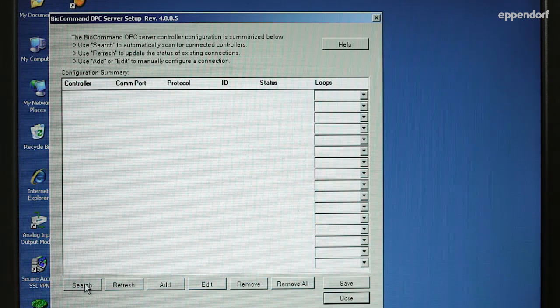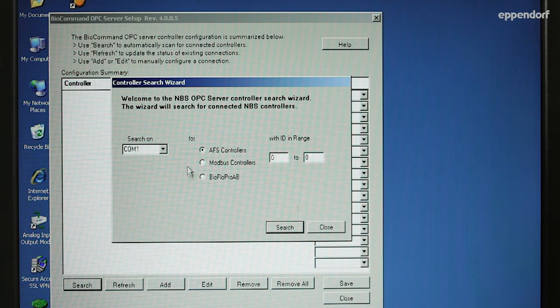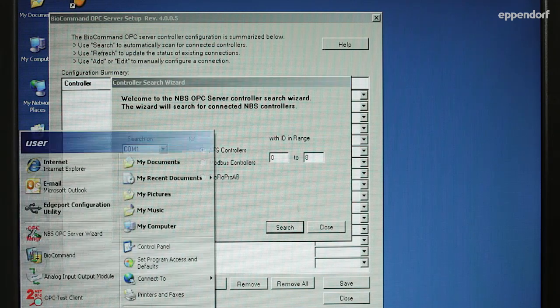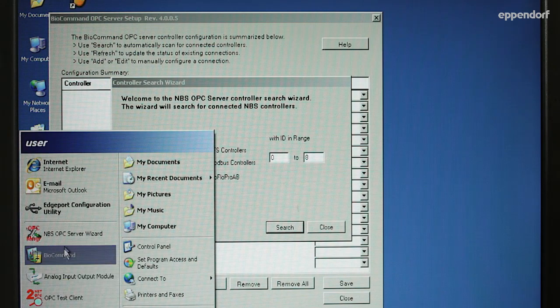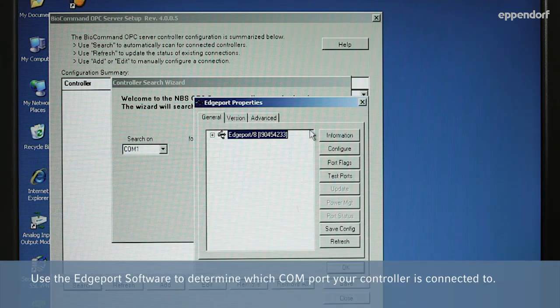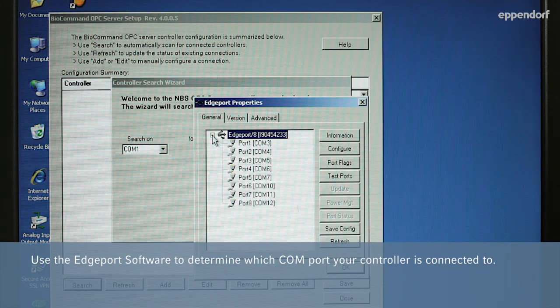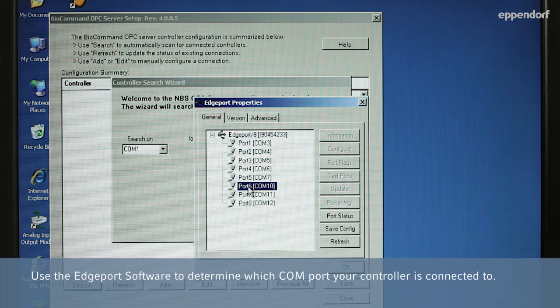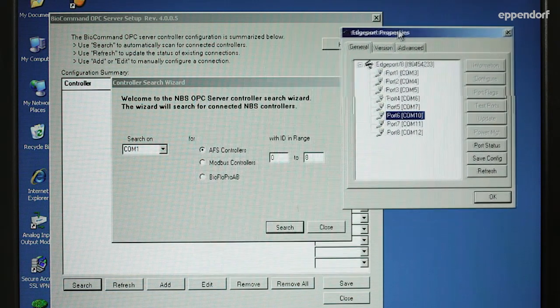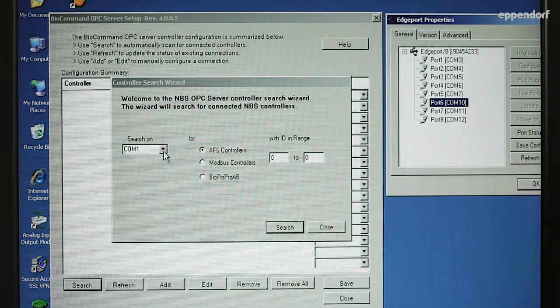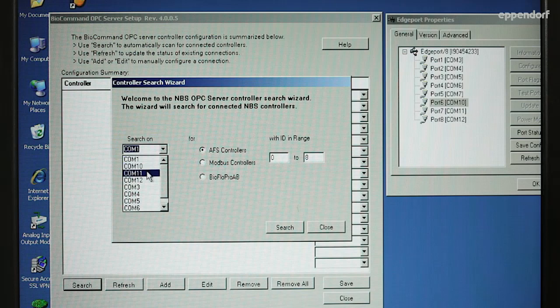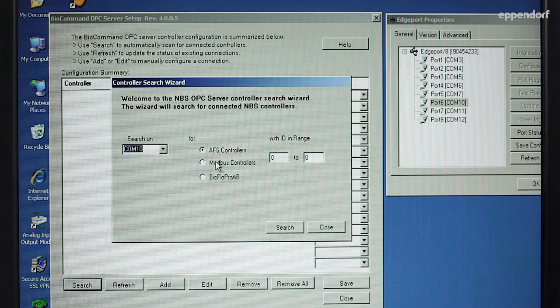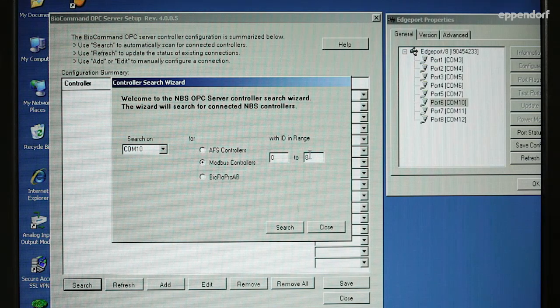Click Search to add new controllers. When the search window opens, click on the Search On drop-down arrow and select the appropriate communication port. Then select the protocol that your controller is set to by clicking on the appropriate option button. Set the ID range you wish to search and then click Search.